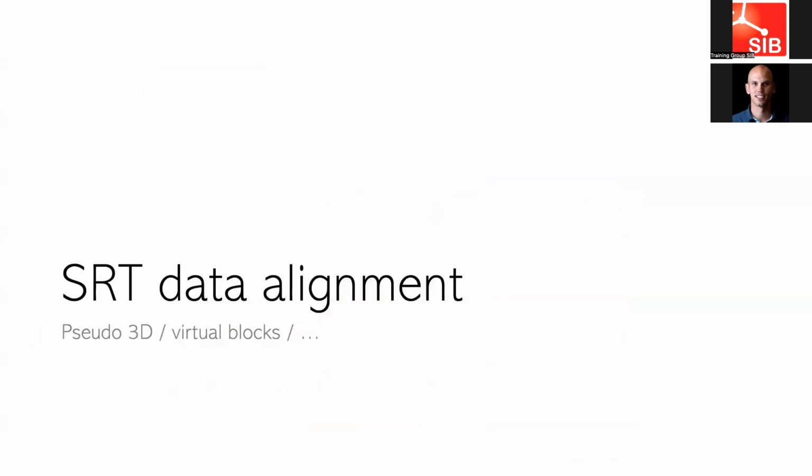Okay, is there any question on the single cell spatial data integration? For the practical part, we will only do stuff related to the previous thing. So we will try cell-to-location for deconvolution. We'll do Tangram and Spage for prediction of missing genes and comparing them. But I also thought let's cover other topics, so they're not in the practical, but at least you have a bit of an idea on them.